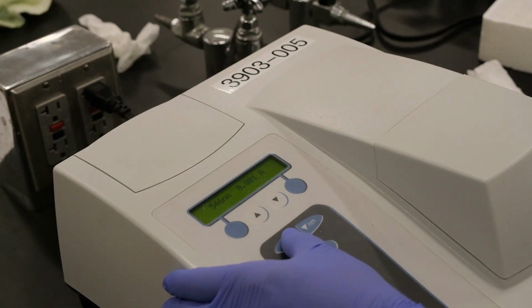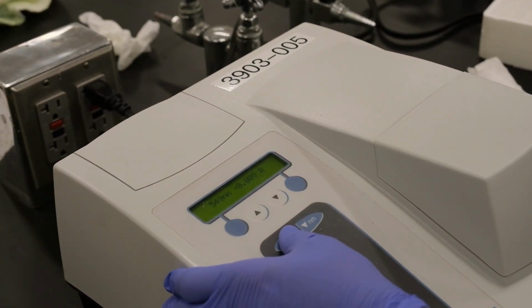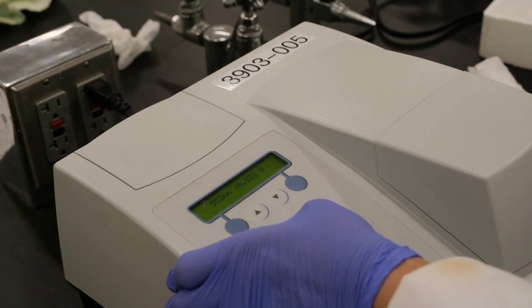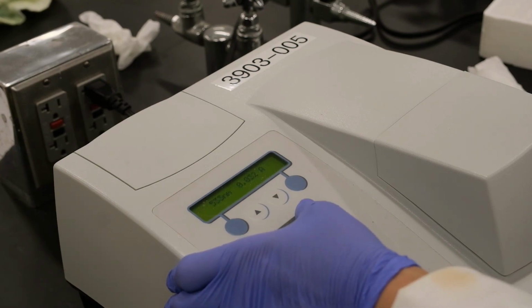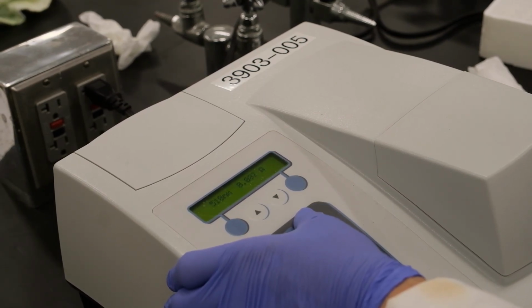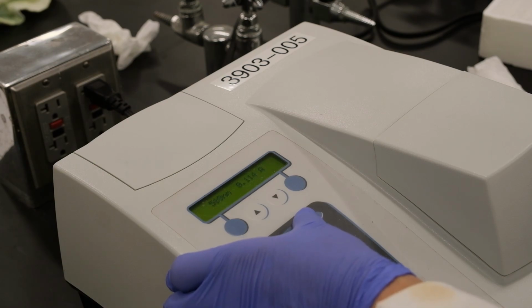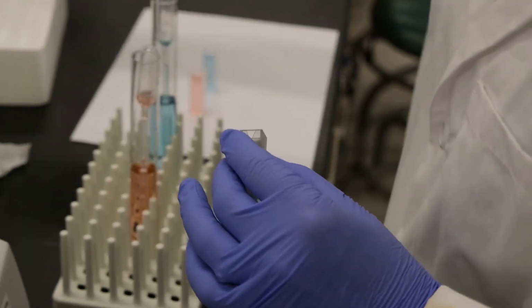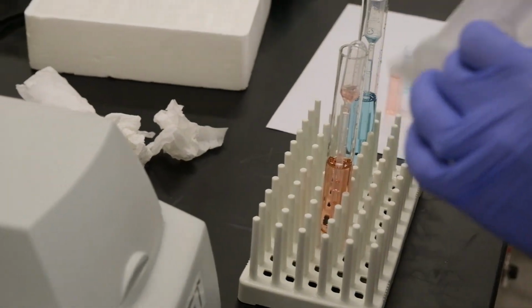Now we set the maximum at 500. What is that? According to experiment 13. And we read the absorbance of the Allura red, and then by interpolation we obtain the concentration.